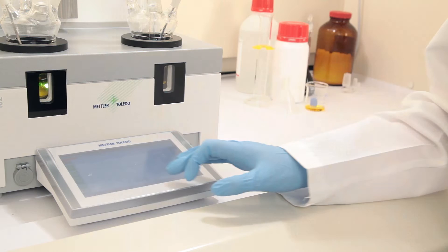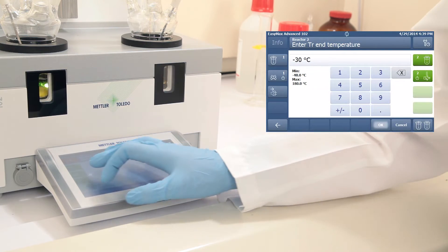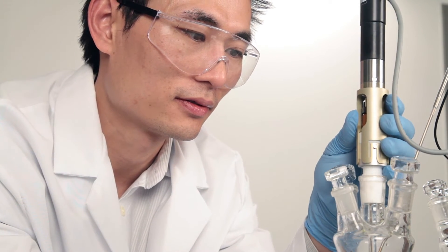The ability to run reactions at any desired temperature from minus 40 to 180 degrees C allows chemists to explore new reaction conditions and develop more innovative chemistry.